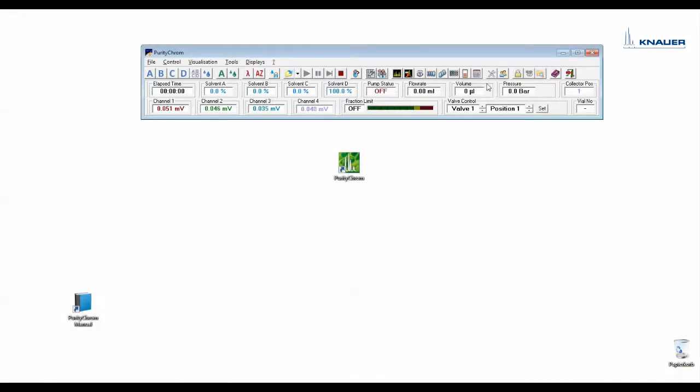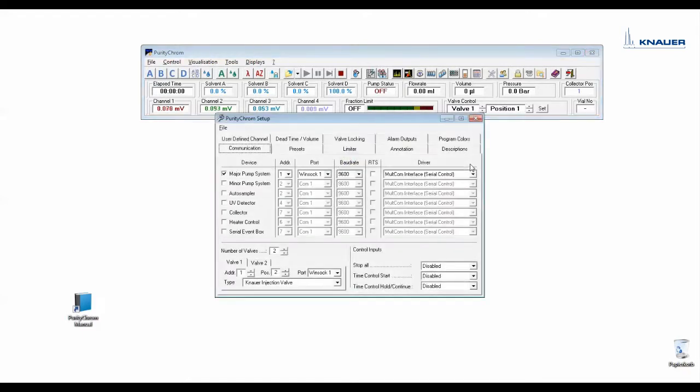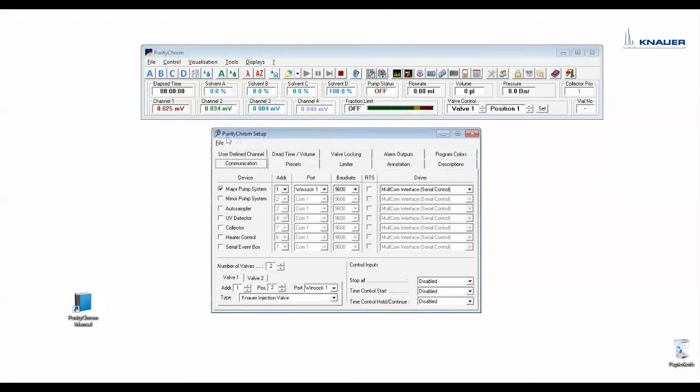To set up or configure your system, please go to the Setup icon here. A Setup window will open.